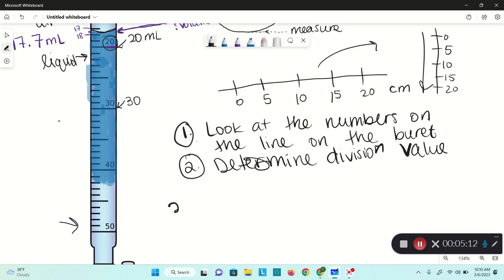And then three, we're going to measure from the bottom of the meniscus, from the bottom of that curve.